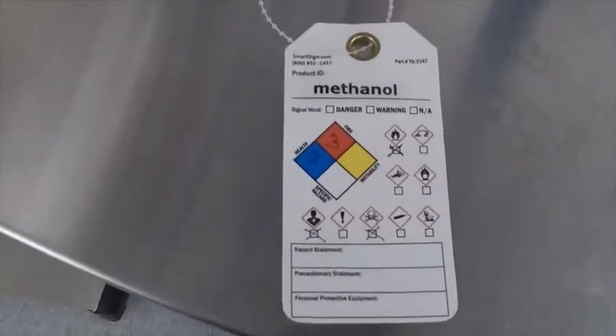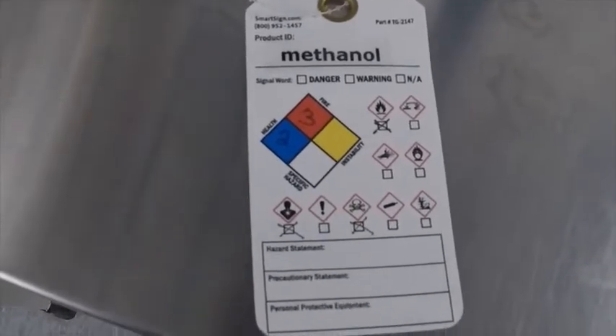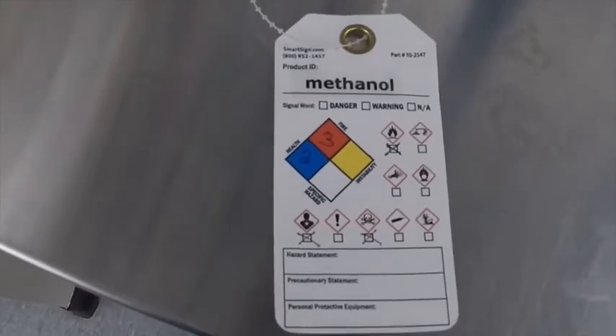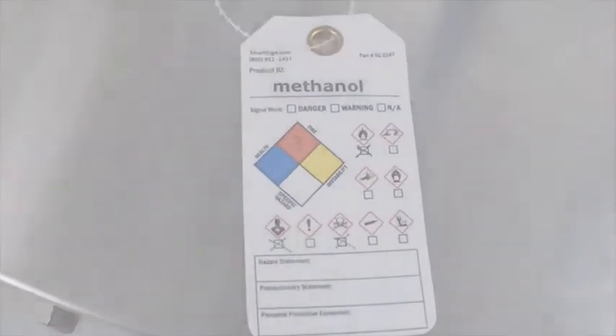As an aside, these GHS and NFPA labels are available from various vendors, so you can purchase them and use them to label the chemicals in your laboratory so that you have both NFPA and GHS labels on them.